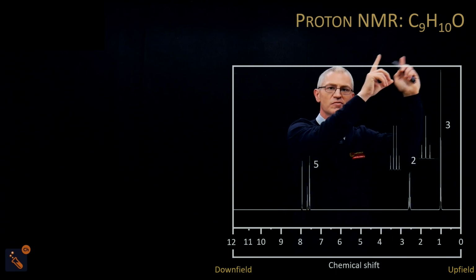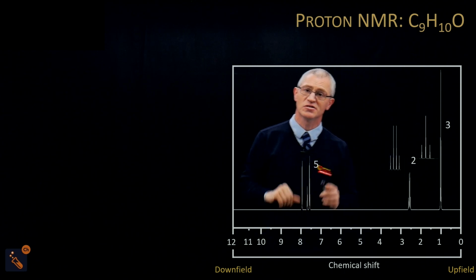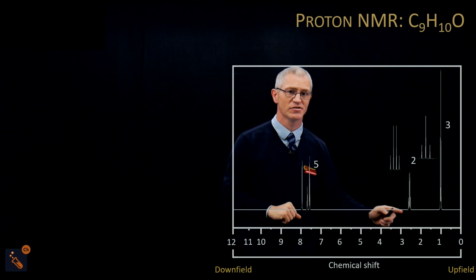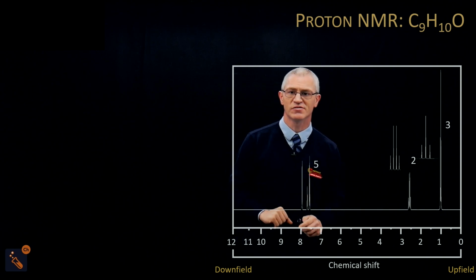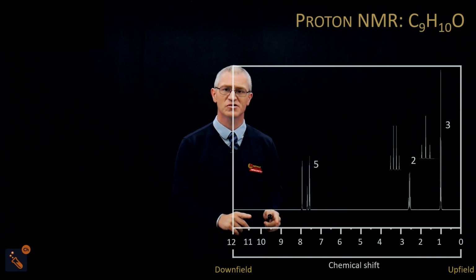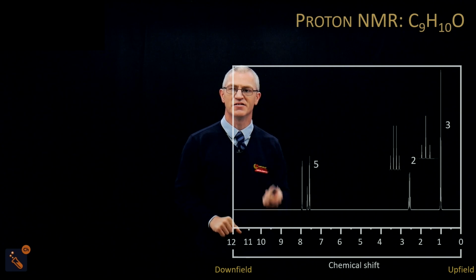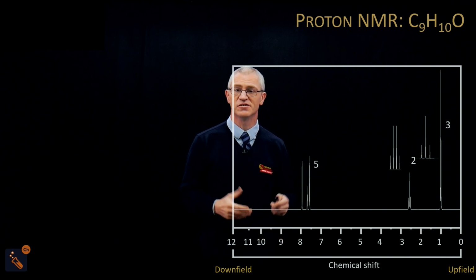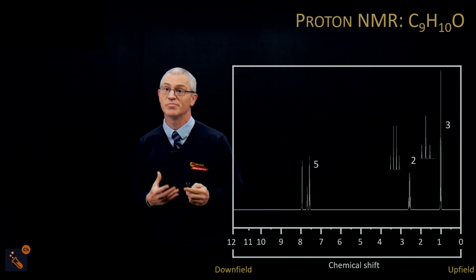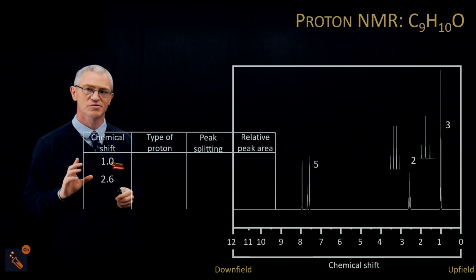Now also, we've got an oxygen up here. So we know we haven't used up all our atoms. So an oxygen could be an alcohol. So look for an alcohol. Do you see a singlet with a 1 by it? No, so there's no alcohols. And then this also could be, for example, an aldehyde. That comes up between 9 and 10. There's no aldehyde peak, and therefore this is not an aldehyde, which kind of makes us think it might be a ketone.